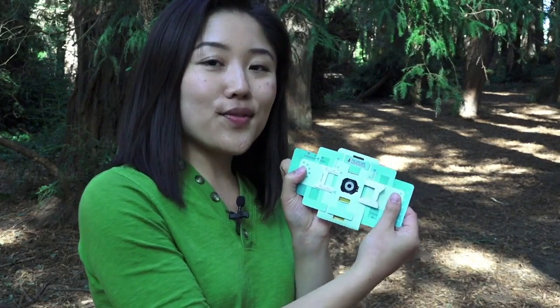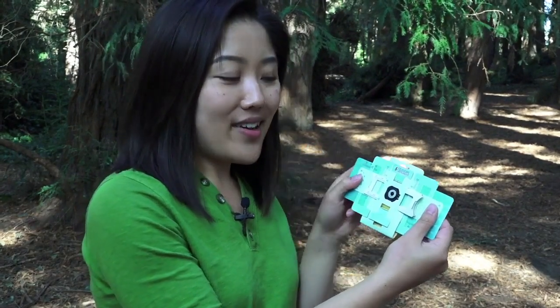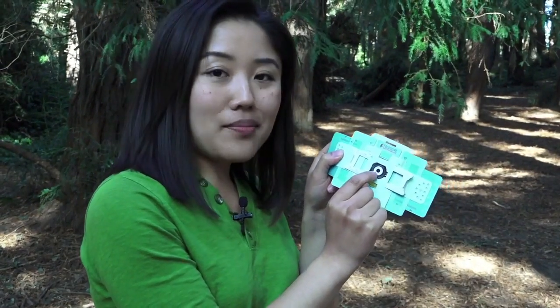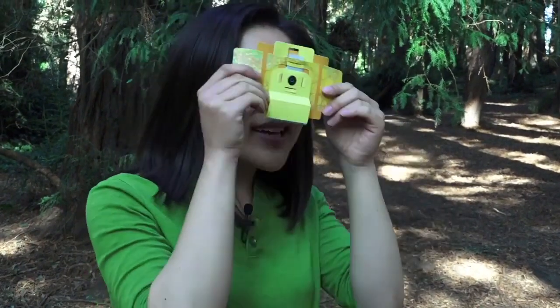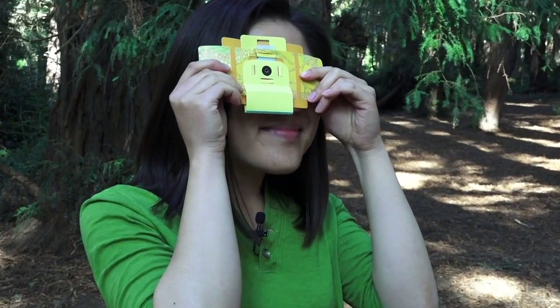To explore with your foldscope with your own eye, put your eye right up next to the lens right in the middle. I'm using the sunlight as your light source.